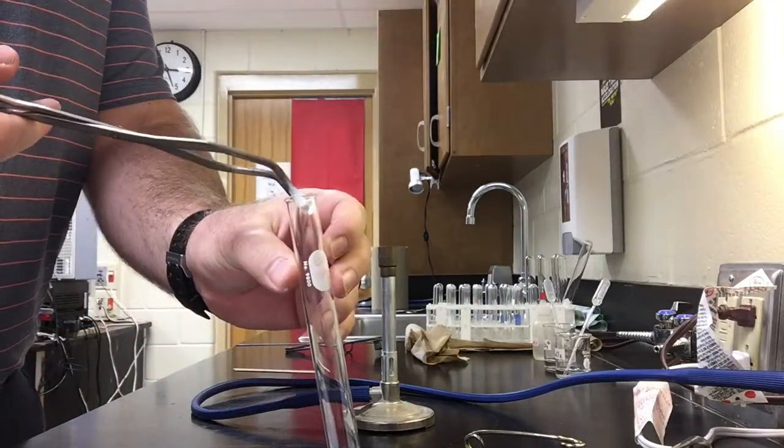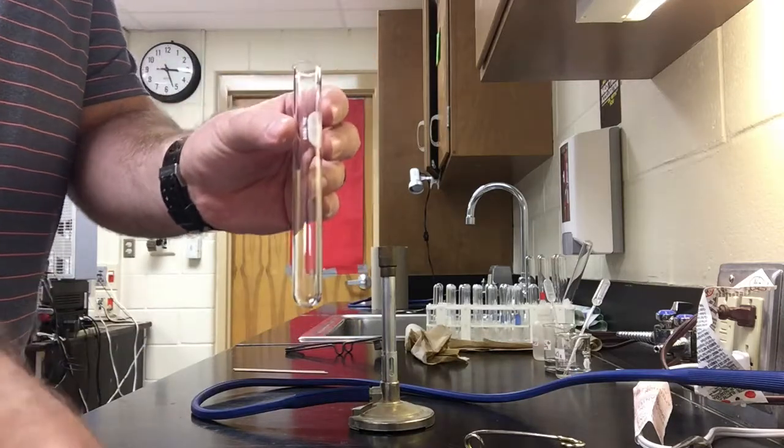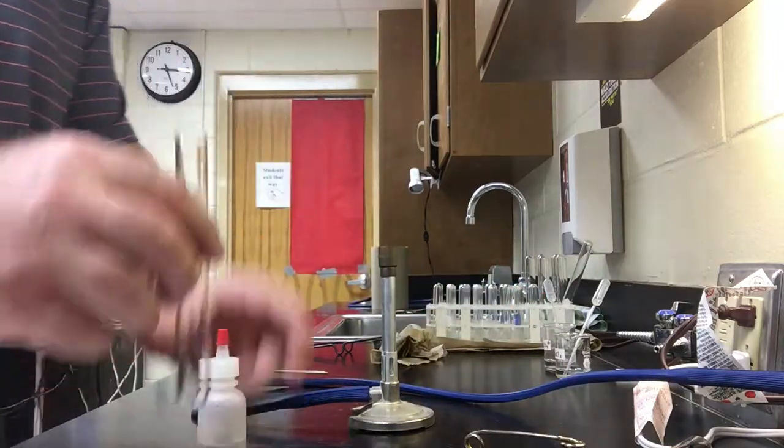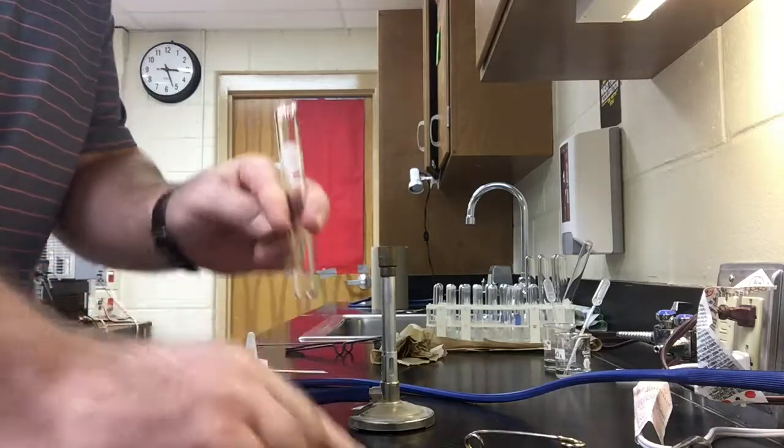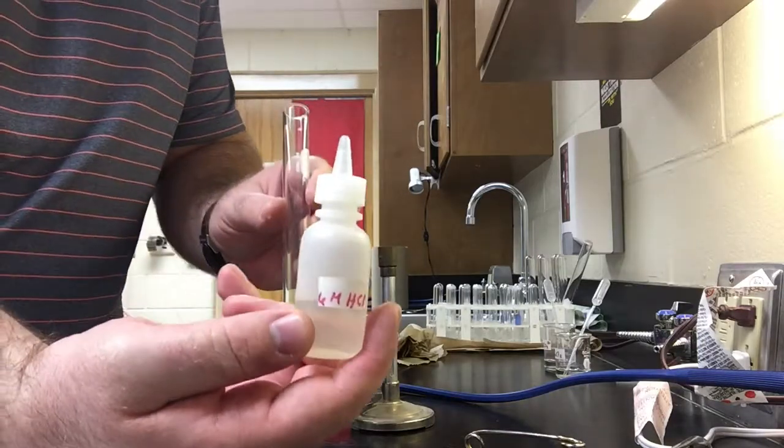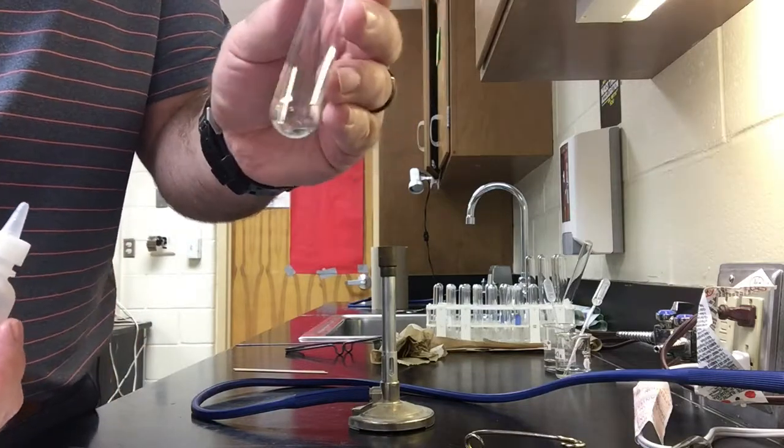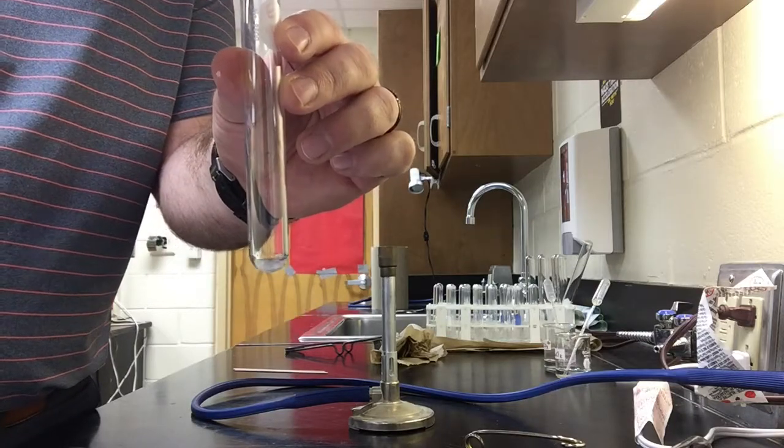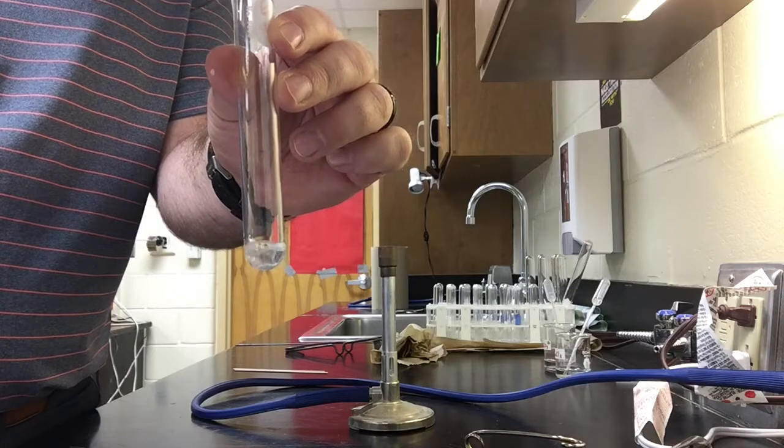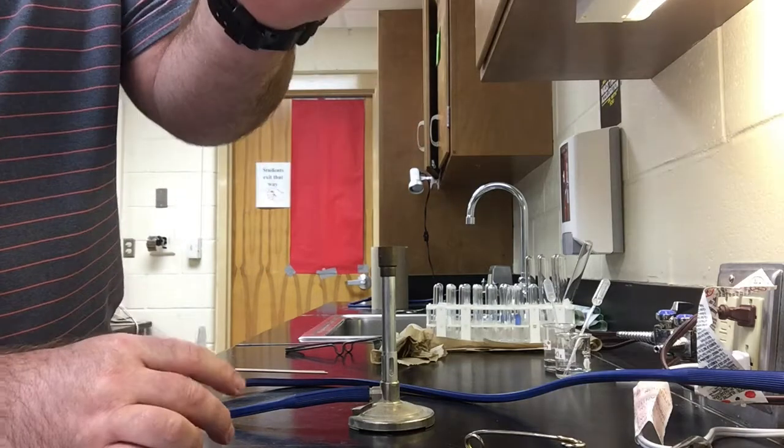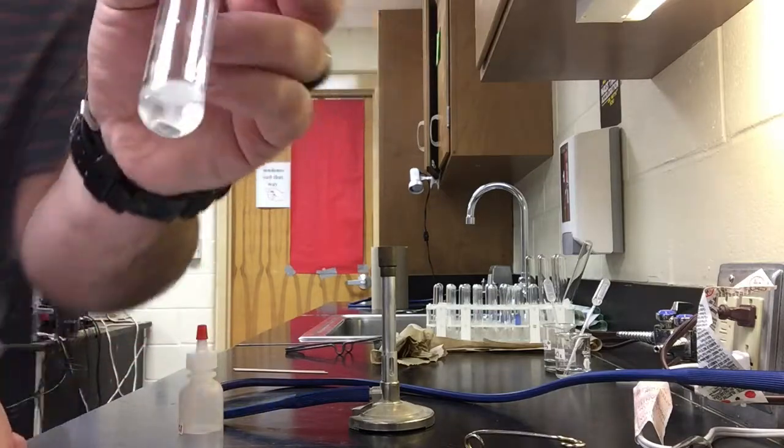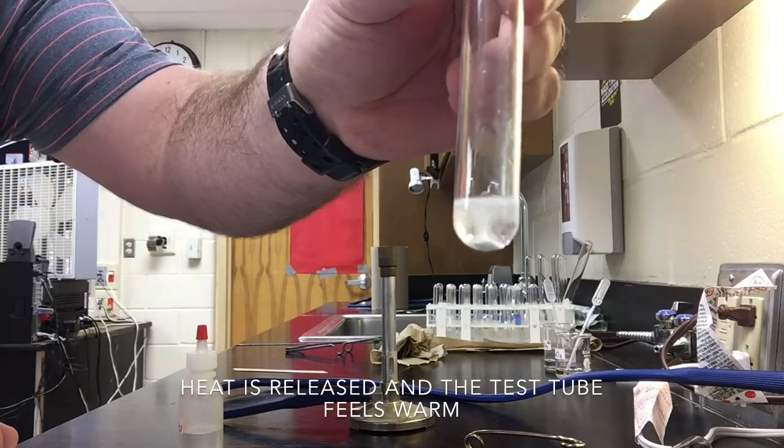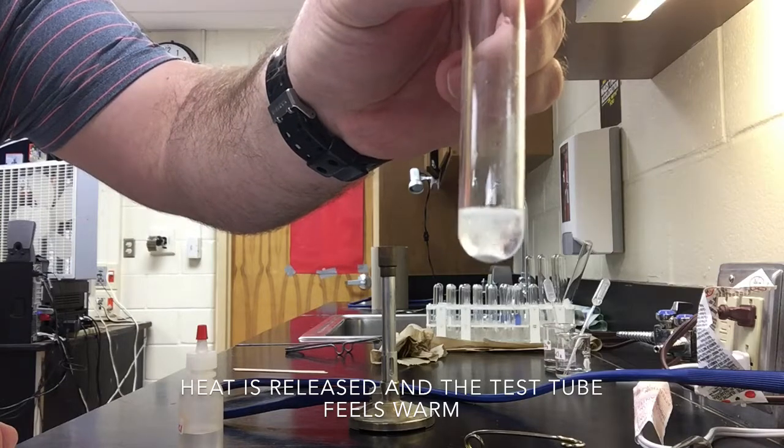All right, so I'm going to take the zinc and I'm going to place it into the test tube. Now, in addition to the zinc at the bottom of the test tube, I'm going to add 6 molar concentration of hydrochloric acid until I have enough to cover up my zinc. So I'm going to go ahead and add that. Okay, so I'll let you take a look at the reaction that is taking place once I have added the hydrochloric acid to the zinc.